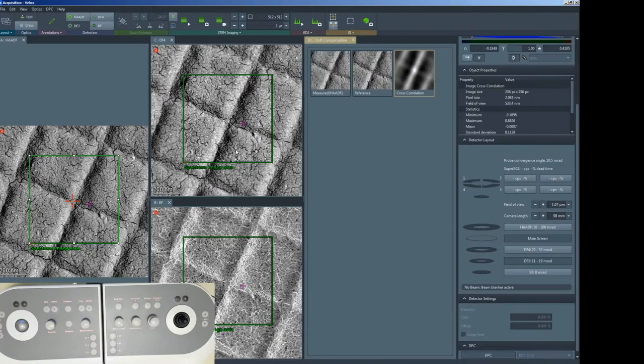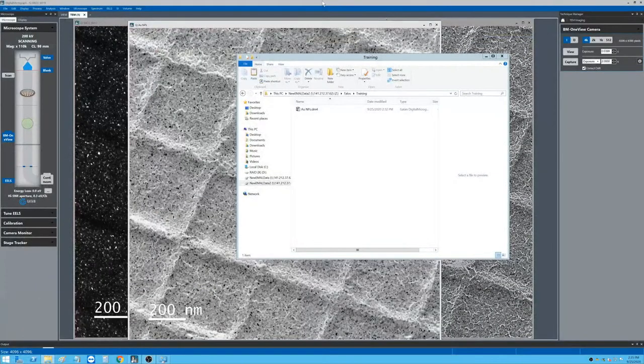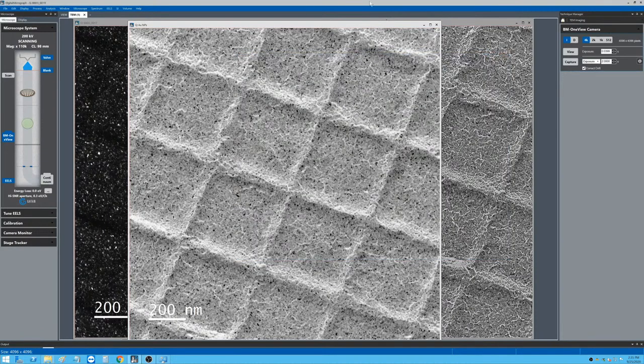Also, just to let you know, Gatan Digital Micrograph is free to normal users. You can just go to their website and download the latest free version. With that version, you should be able to do post-processing on the DM4 or DM3 images you take here.